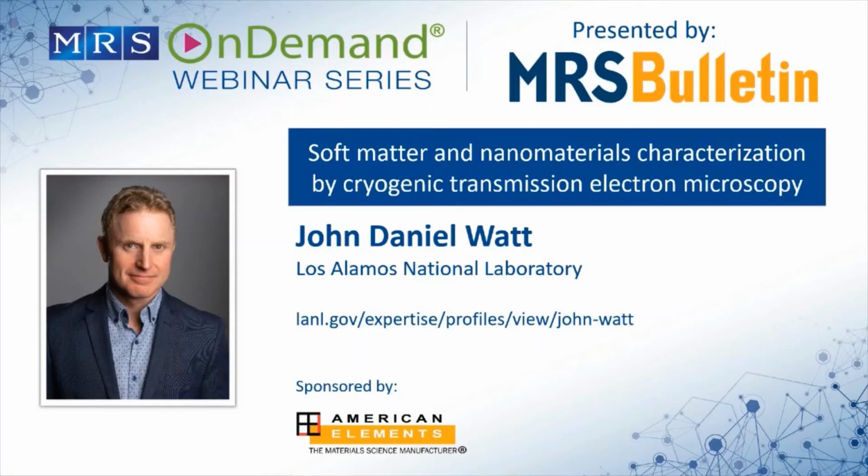Yeah, absolutely. If you're wanting to do something like tomography, then geometry becomes important, right? Because you're tilting, you have to have the right grids and the right holder to give you enough space, so that when you tilt to high angles you're not clipping the edge of a grid bar or something like that. And then this question is very relevant, because the thickness of your ice becomes very important. Often in the grid, the ice will be thicker towards the outsides near the grid bar, so you want to be looking at a sample in the middle where you have a nice thin layer. Okay.